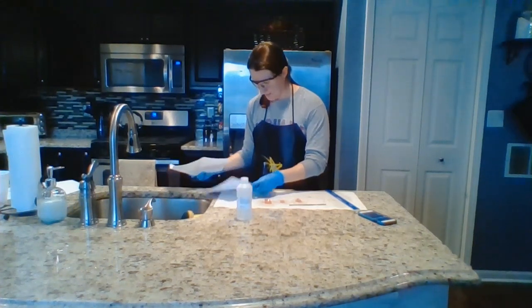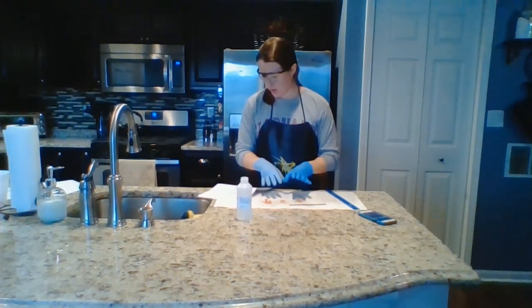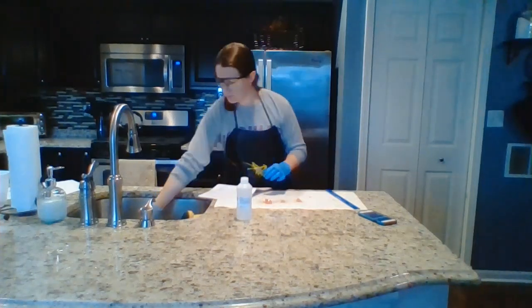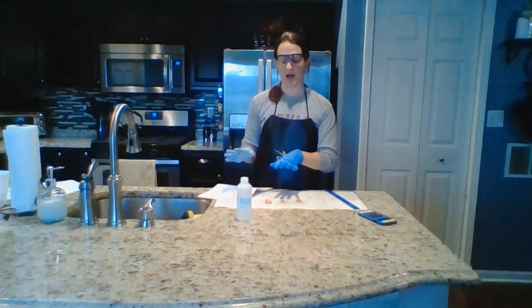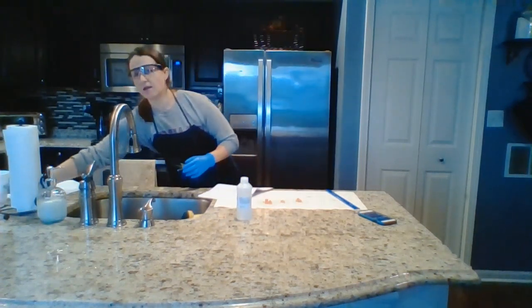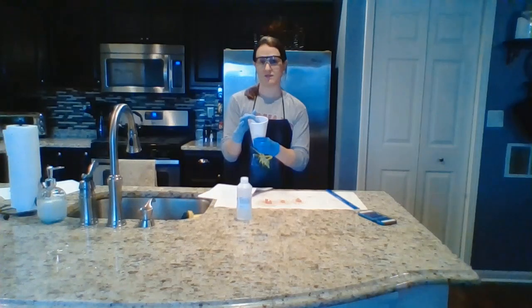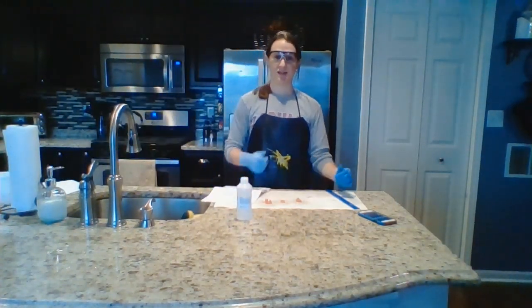All right. Lastly, to finish up group 1 and to finish up part 1, when I'm finished, I'll make sure to wrap all of these up in the paper towel. I can throw them away in the garbage and I can rinse everything else for cleanup. After I've cleaned up part 1, I'll go ahead and do part 2, which is exactly the same, except my agar cubes will be sitting in the vinegar cup for 10 minutes instead of 5. I'll fill in data table 5, and I will submit for points.